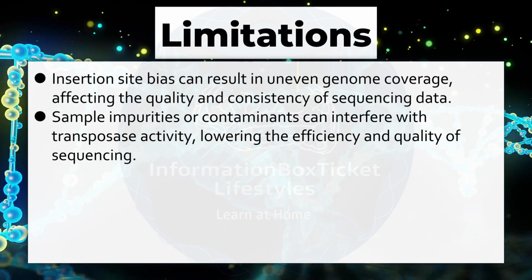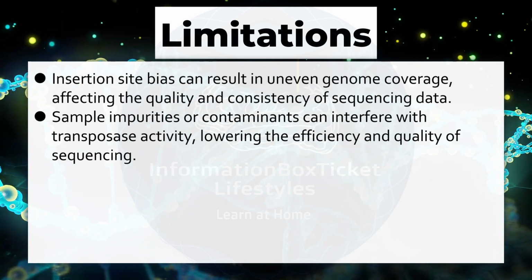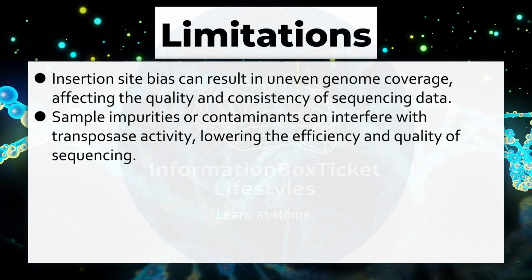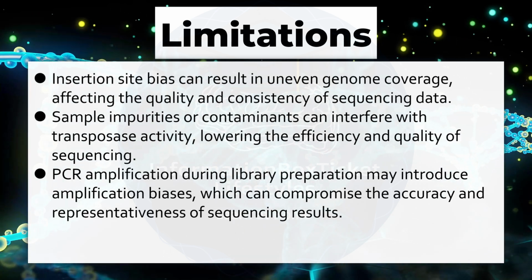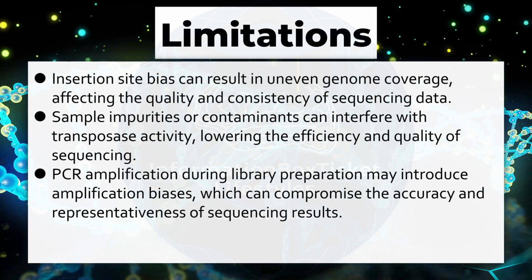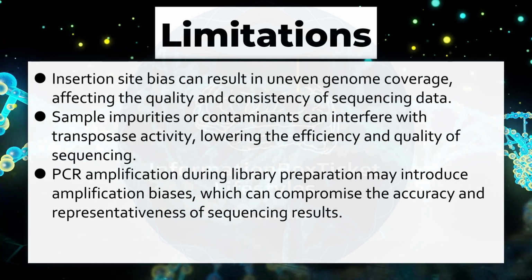Sample impurities or contaminants can interfere with transposase activity, lowering the efficiency and quality of sequencing. PCR amplification during library preparation may introduce amplification biases, which can compromise the accuracy and representativeness of sequencing results.